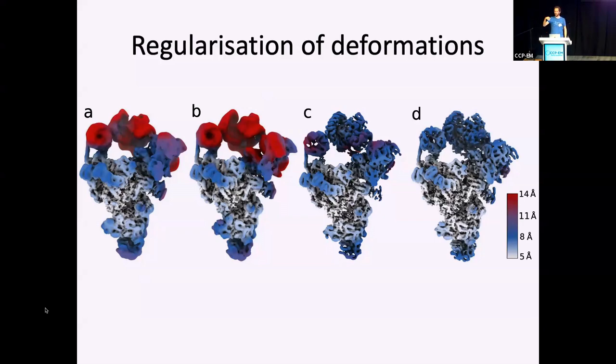This field has suffered majorly from Einstein from noise artifacts, where you put your will onto the data. You use a reference and then you align your data to it. There's a lot of scope in overfitting the data, and model bias can have a very bad effect.